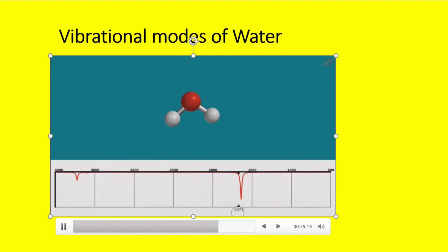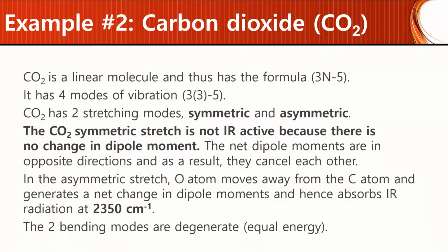And then finally down here at 1640, we have a bending. So HOH bending, and this is an in-plane bend. All right, so I hope if I ask you what kind of in-plane bend, you can answer that.